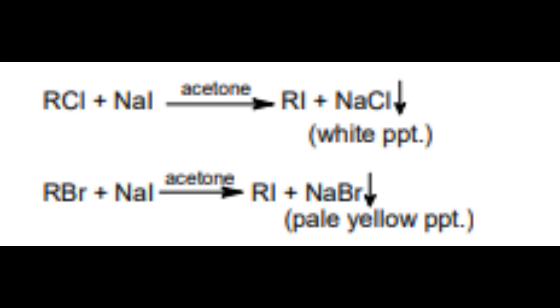Procedure: dissolve 0.1 g or 0.1 ml of the organic compound in carbon tetrachloride and add a 5% solution of bromine in carbon tetrachloride to it dropwise with shaking. The discharge of color of bromine without evolution of HBr shows the presence of unsaturation in the compound. Note 1. Dense white fumes are produced when a glass rod dipped in ammonia solution is brought near the mouth of the test tube if HBr is evolved in the reaction.